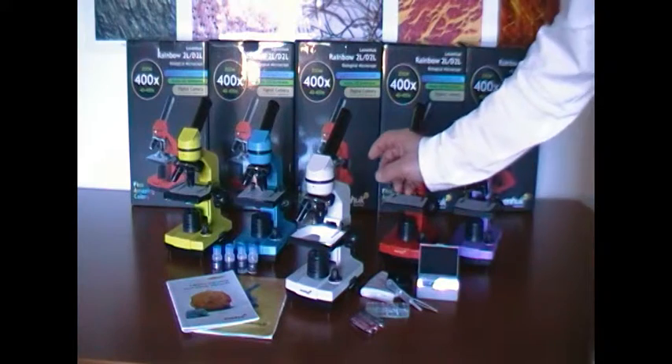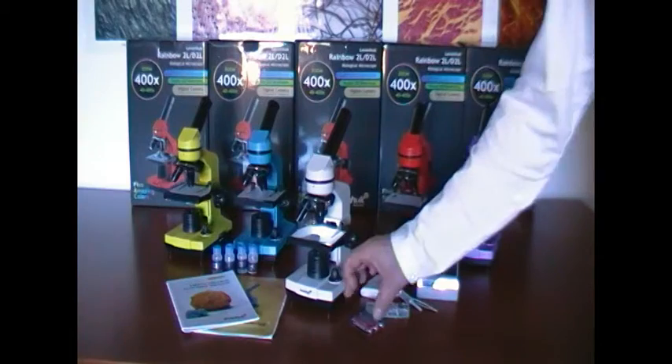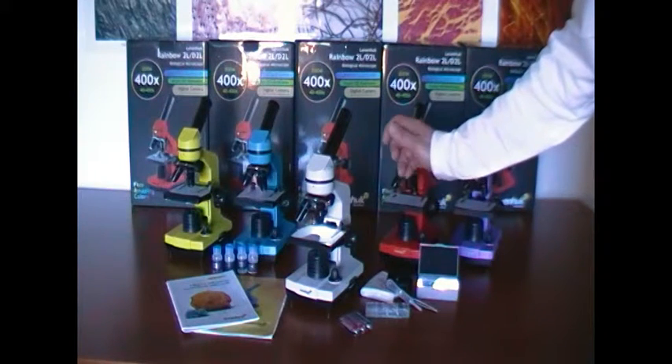The microscope also has a condenser. It is powered from an electrical outlet, but I can also insert AA batteries and the microscope thus becomes independent of the power source.